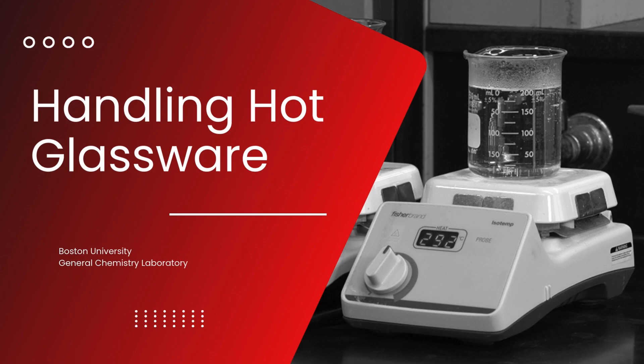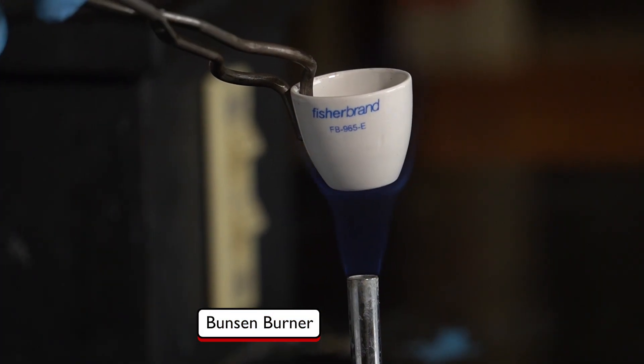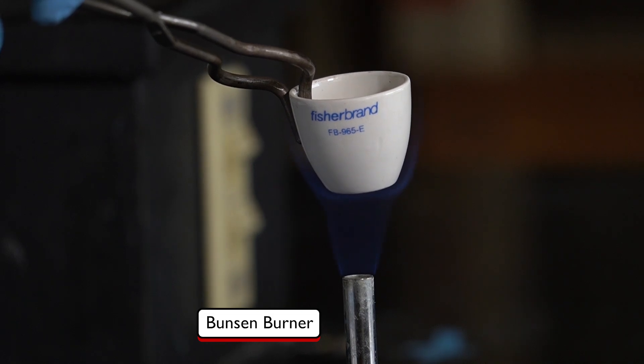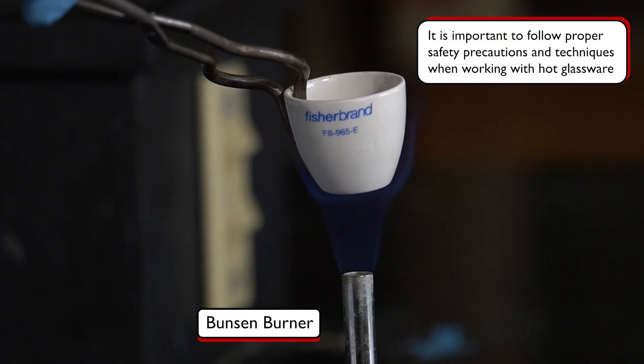In this video we will discuss how to handle hot glassware safely. Not all reactions proceed quickly enough at room temperature in the lab — sometimes we need to heat things up using a hot plate or even an open flame. When doing this, it's crucial to follow proper safety precautions and handling techniques to minimize hazards.